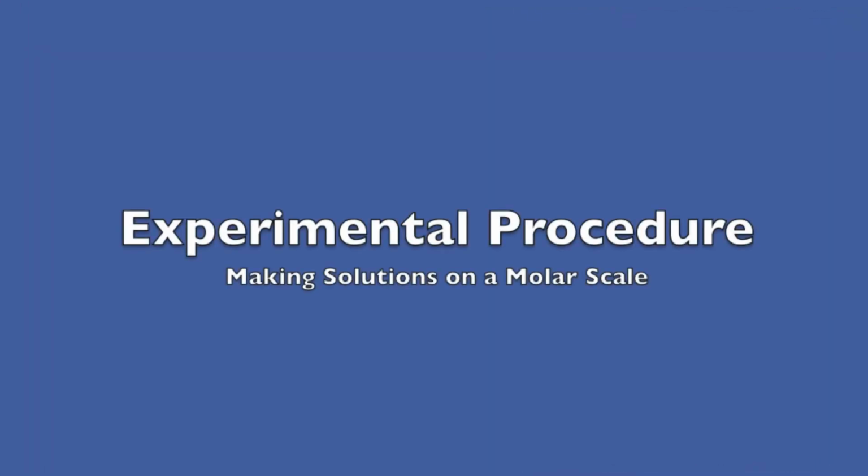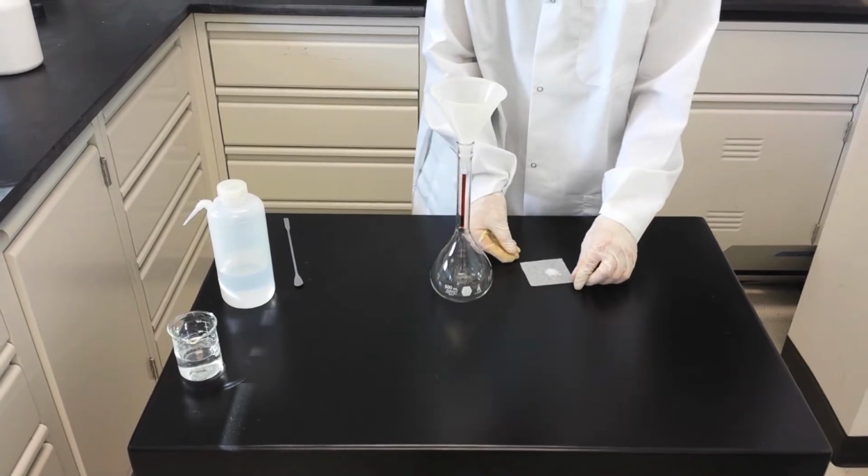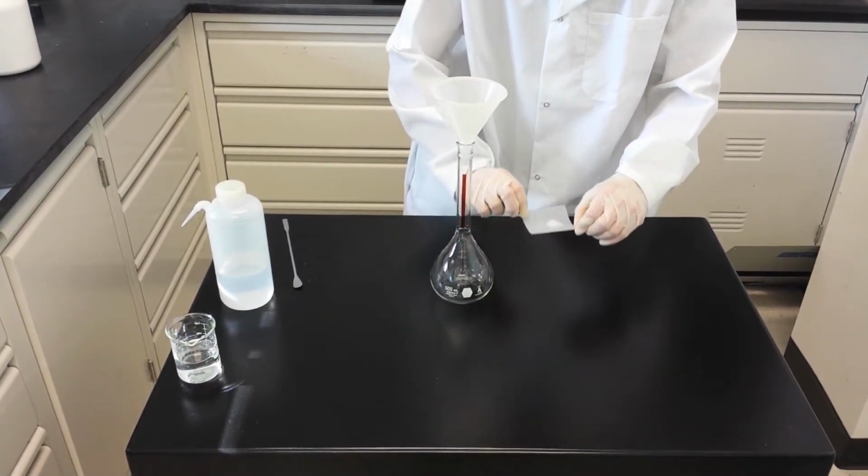Experimental procedure. Making solutions on a molar scale. To make molar solutions, you first need to add the solute to the volumetric flask.